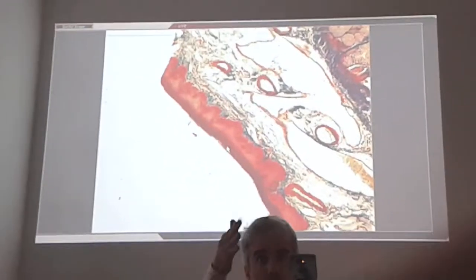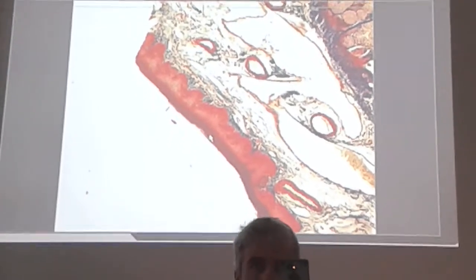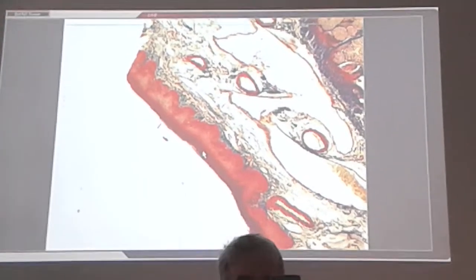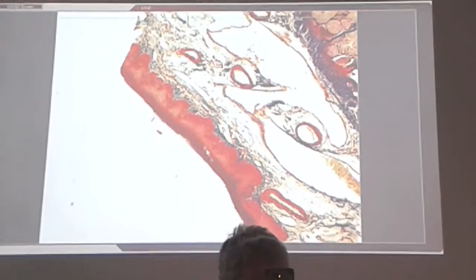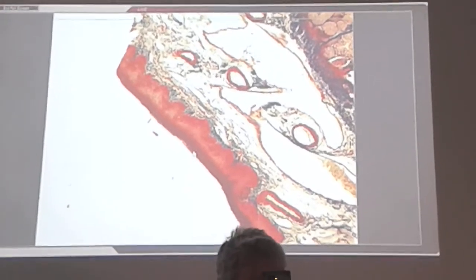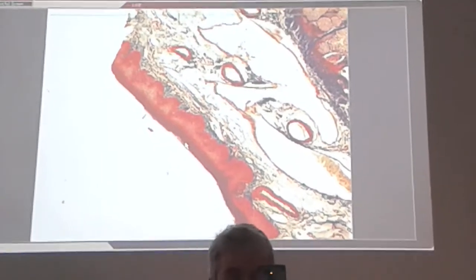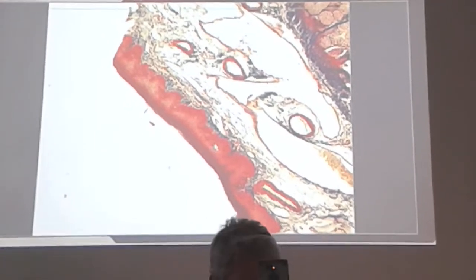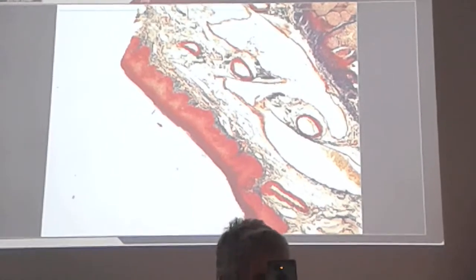As you see, the tongue is lined with an epithelium. I'm sure the ones who attended the course easily recall, we are always investigating by the layers. In each organ, we are investigating the layers of the organ. So starting with the mucosal surface, the tip of the tongue is lined with a stratified squamous epithelium. Here you can easily recognize the stratified squamous epithelium with many cellular layers, and the squamous cells on the uppermost layer.